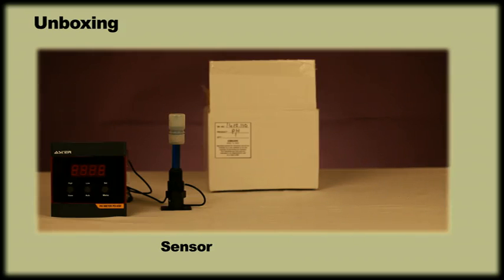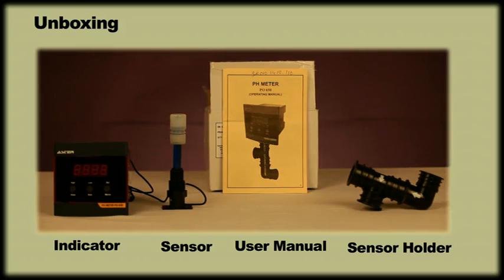Unboxing: The entire package comes with a sensor, indicator and a sensor holder along with user manual.